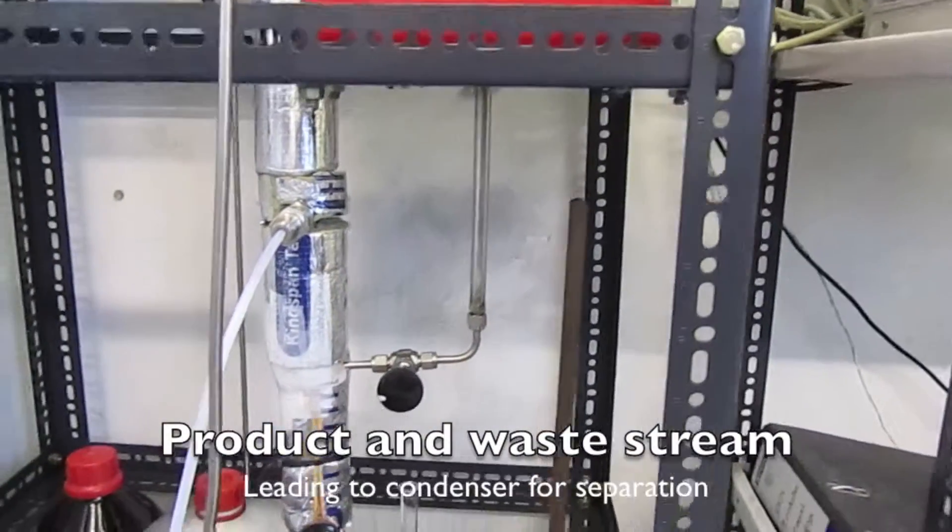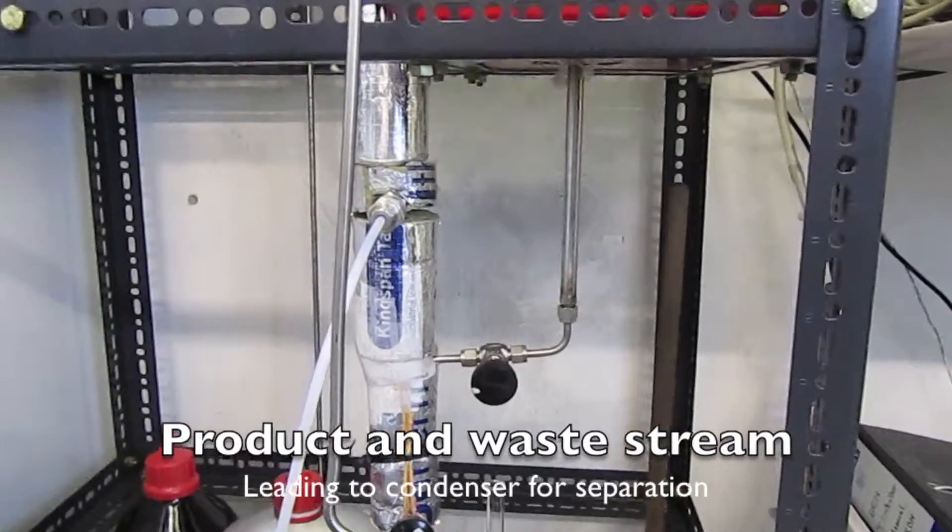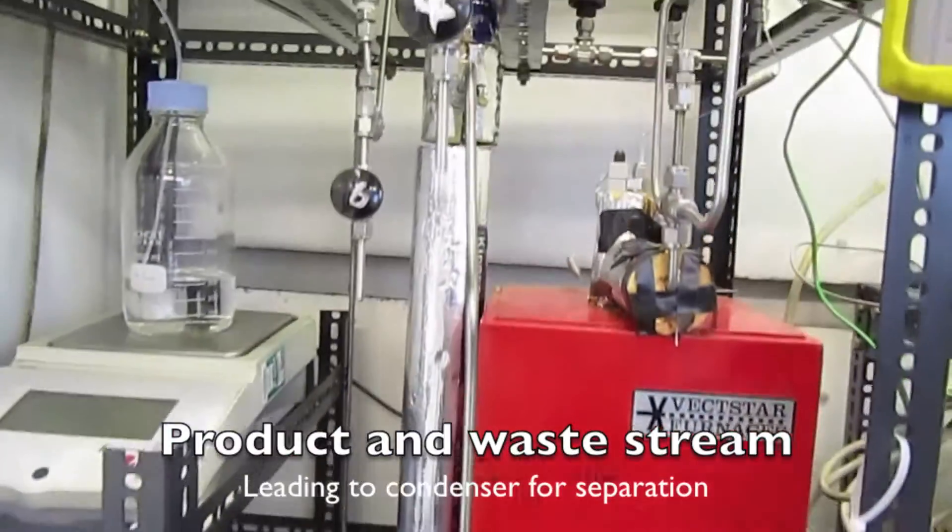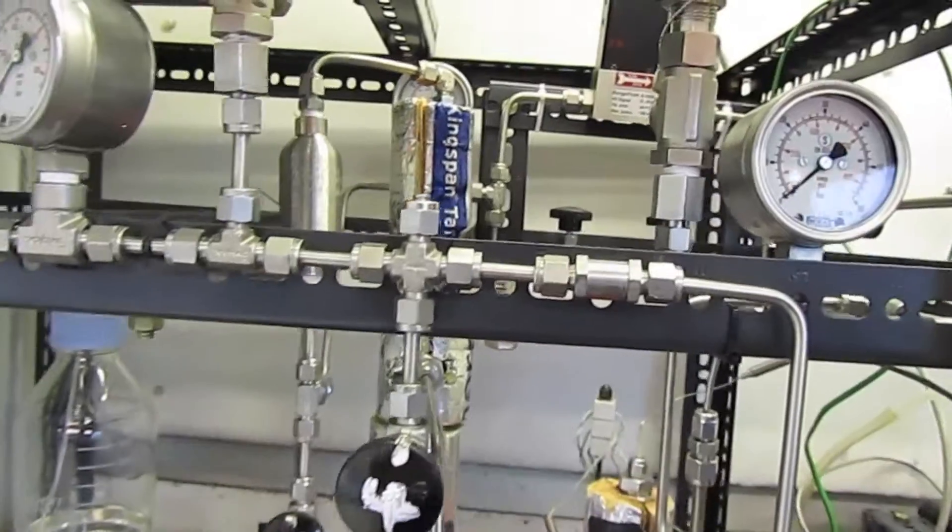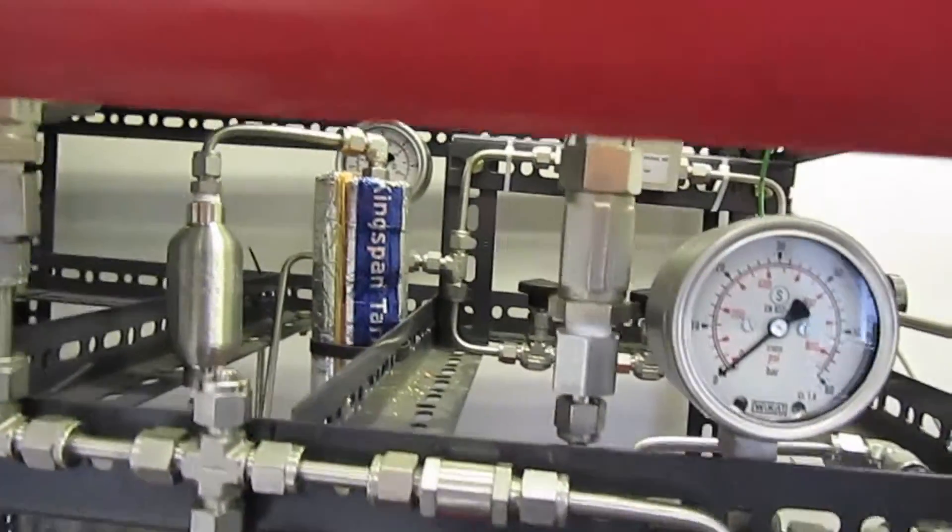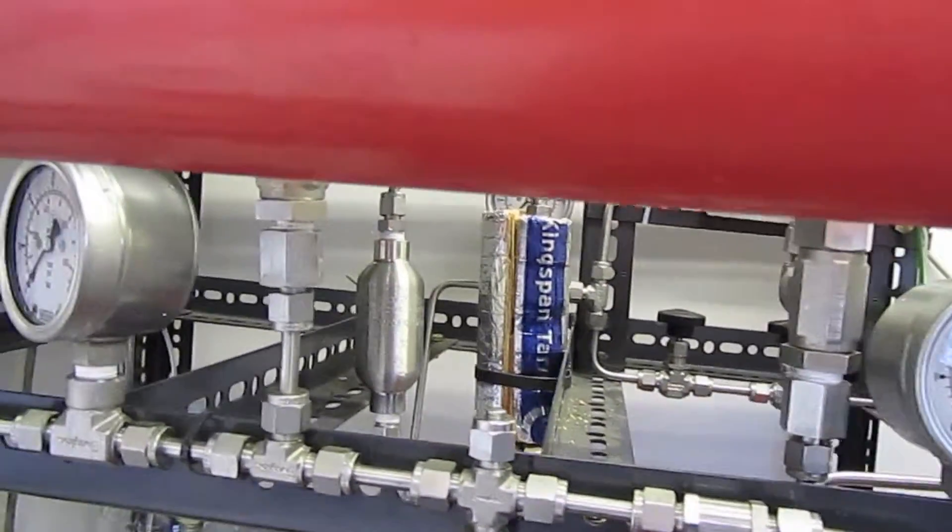The feedstocks pass through the reactor to the catalyst where some are converted to the desired products and the unreacted feedstock is considered as a waste stream. Both streams are collected and separated offline.